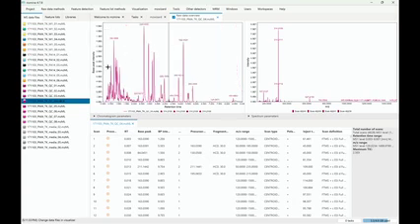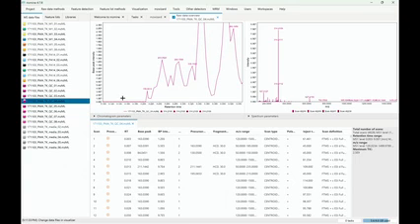And so coming from here, we can now optimize the wizard, and this was just getting an idea about the data. But now we can optimize the wizard and then directly start with the processing. So first we see that here, again, we divert it into the waste, and then afterwards we have this little hump that maybe we want to cut out.